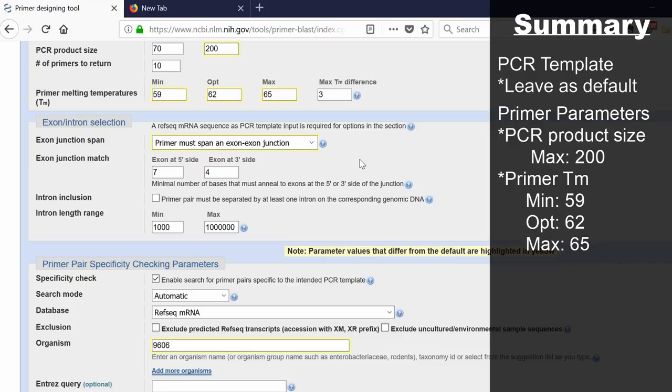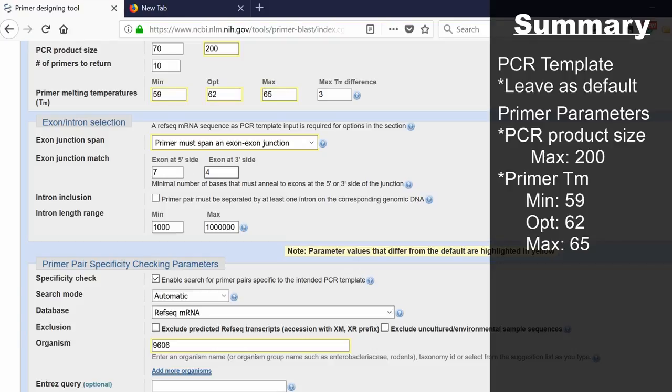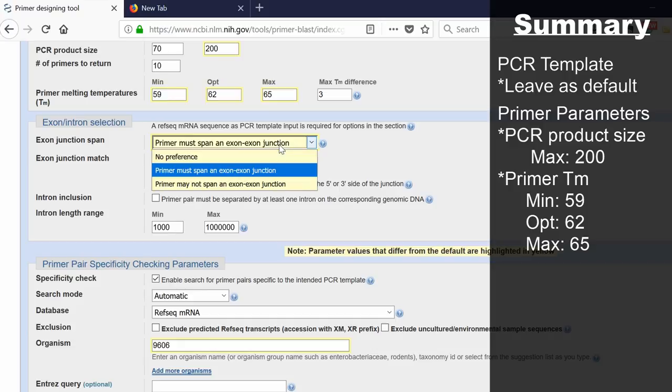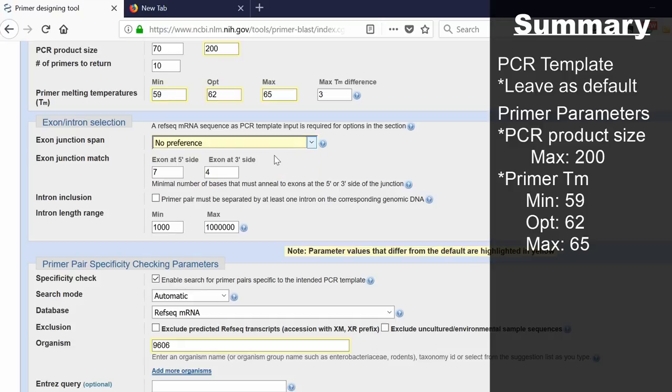This is selecting for mRNA to avoid any genomic DNA amplification. If you select this, you can then specify the base pair number on the five prime side and the three prime side that you want it to bind. This is saying seven base pairs on the five prime side and four base pairs on the three prime side. I personally don't select exon-exon junction spans, but you can do if you wish.